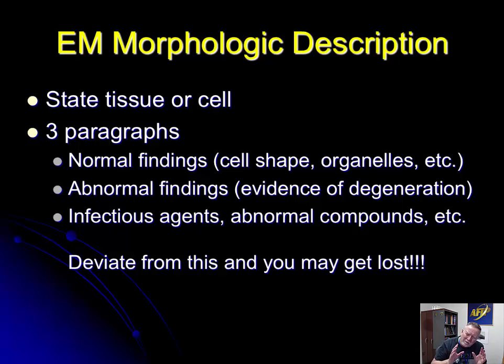This is probably the most different from describing EM versus describing glass. Once again, you're only describing a couple of cells. It's a little bit more of a specialized interpretation. And so, especially for grading purposes, if you are trying to convince the person who's reading this you know what you're talking about, a good thing would be to describe how many of what cells you're looking at.